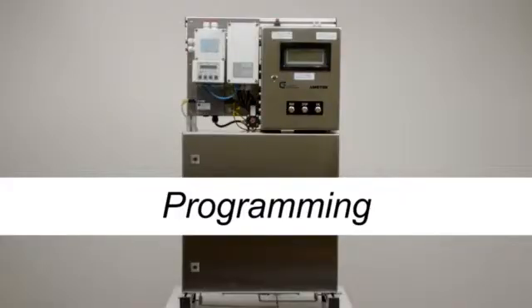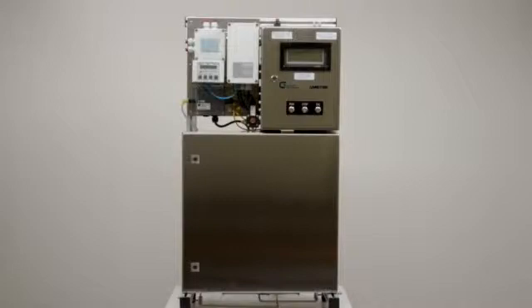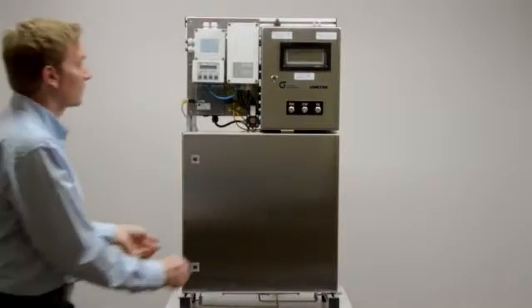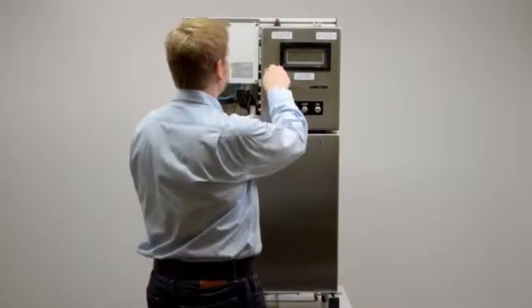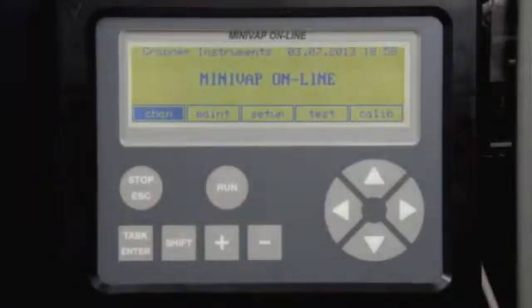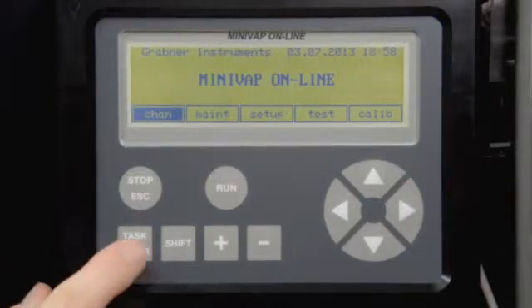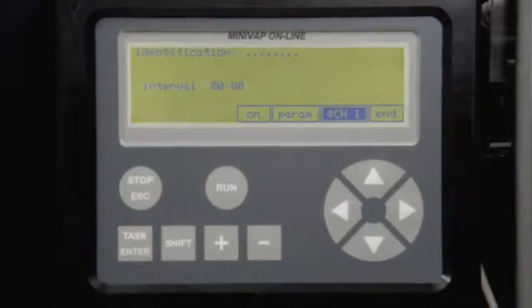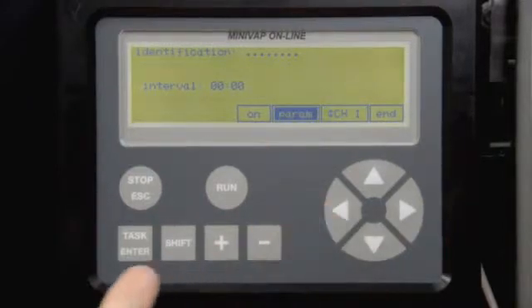Programming. Six measuring channels and one calibration channel can be programmed. Each channel can be programmed individually so that different methods can be programmed to run on the same sample stream. To program the measuring channels, put the cursor on Chan and press Task. Go to Parameters and press Task.